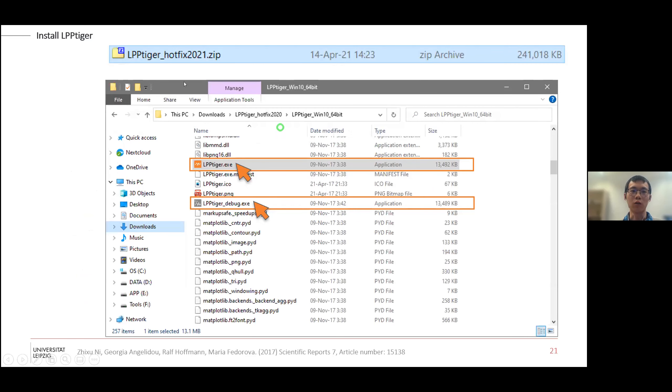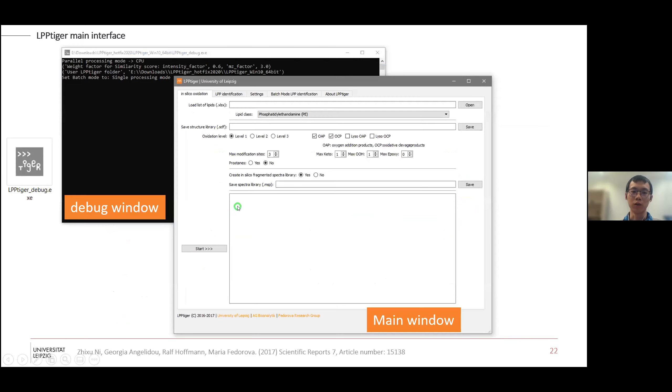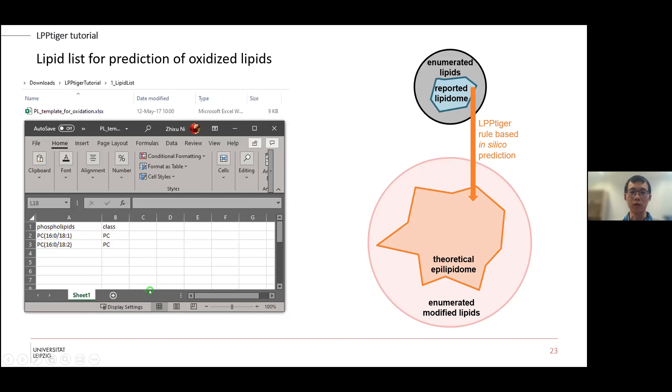If you download the software, you don't need to install. You just unzip it and then you can find two executables - the normal one and the debug mode. If you start the normal one, you get only the main window. If you start the debug mode, you will have an additional window to monitor what is going on behind the software.